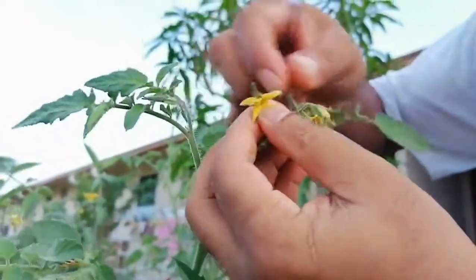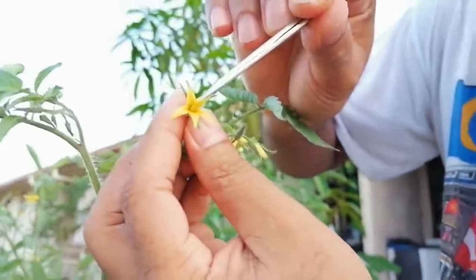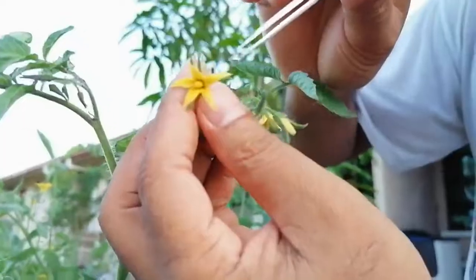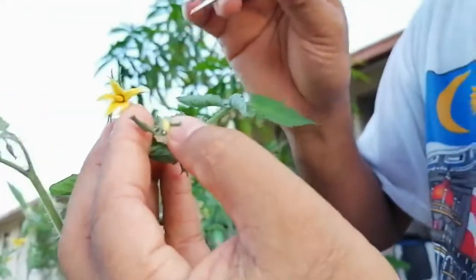This is the tomato flower. You can see the petals, the stigma at the top in the middle, and the surrounding yellowish color is the anther. When doing emasculation, we obviously have to take the unopened flower — this one is already open, so it has already been pollinated.